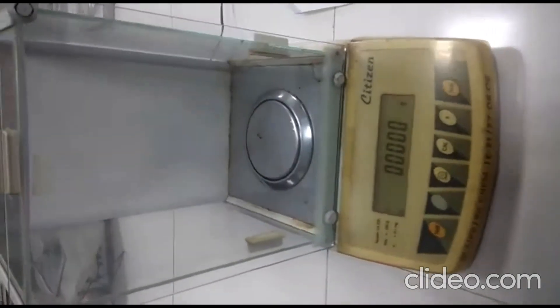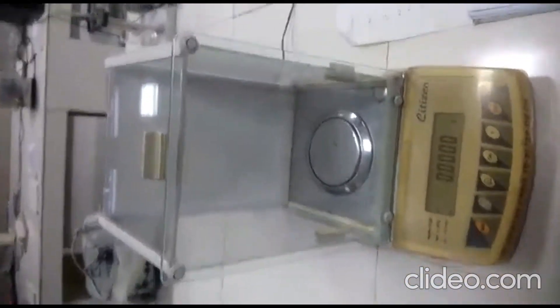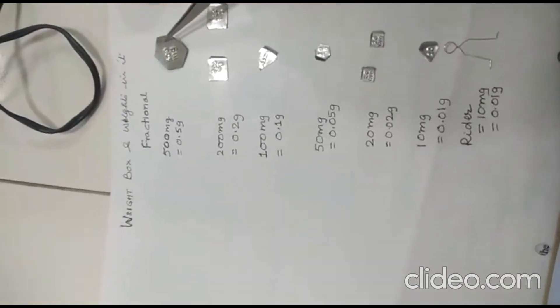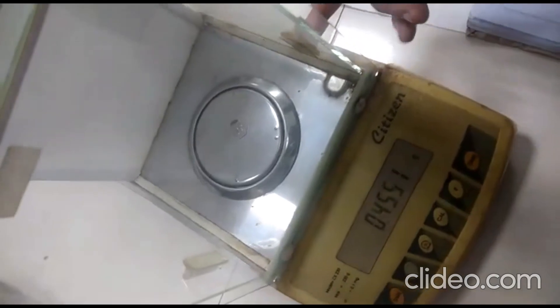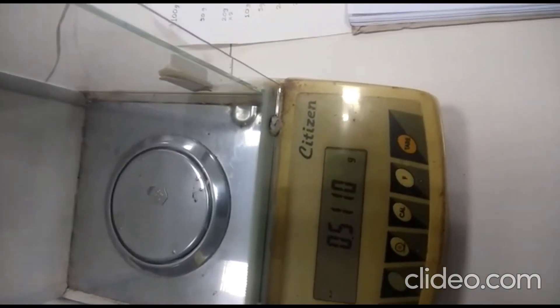With the help of this digital balance we will calibrate the weights. Let us take one example: we take the 500 milligram weight using a forcep, open the window of the balance, and place the weight inside. Whatever weight comes up for the 500 milligram weight — you can see here it is reading 0.5110.